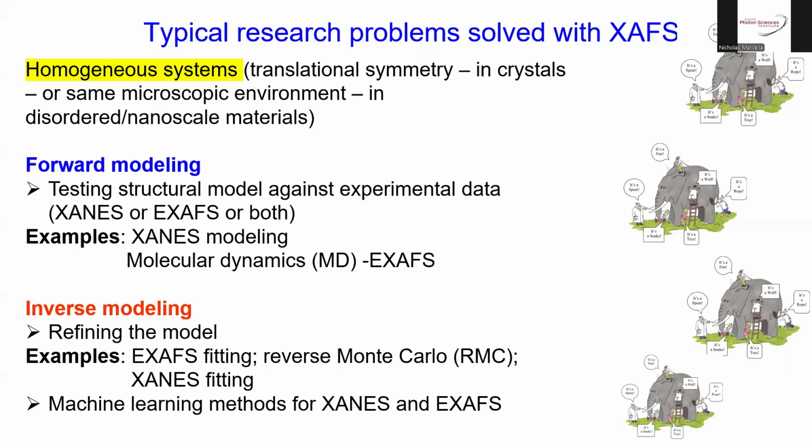Inverse modeling usually involves fitting of some kind, right? Because how can you not use fitting if your objective is to find unknown parameters? You have to use fitting.